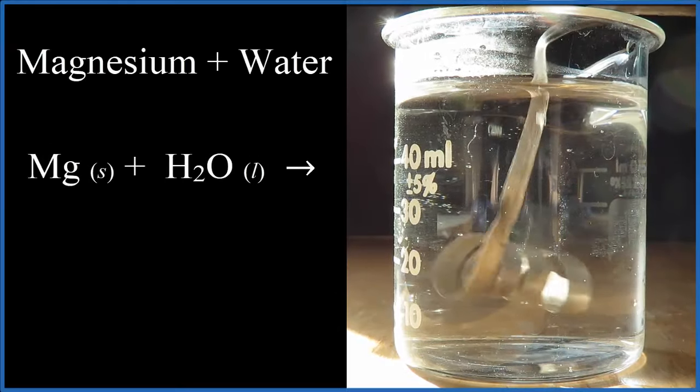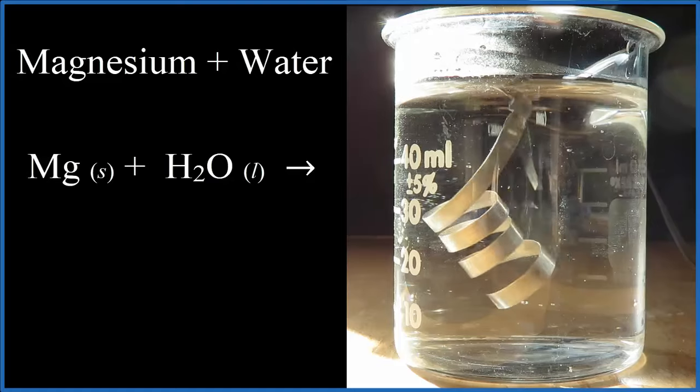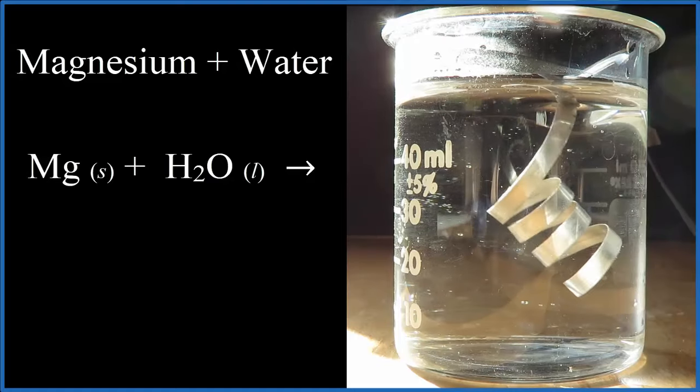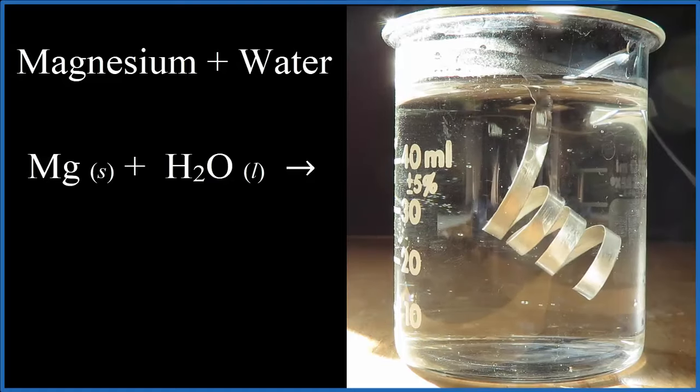Let's take a look at the reaction between solid magnesium metal and water. So we put magnesium metal in with the water, and we want to see what happens.